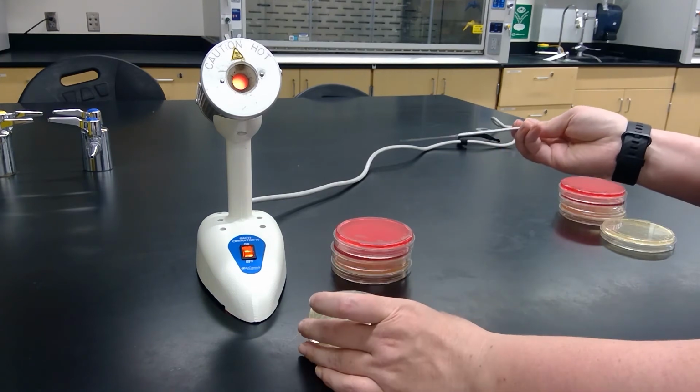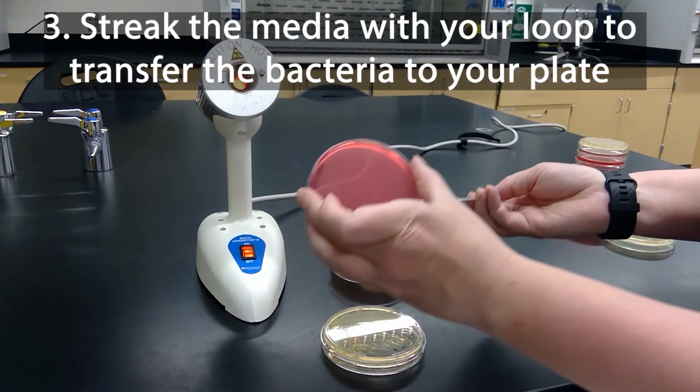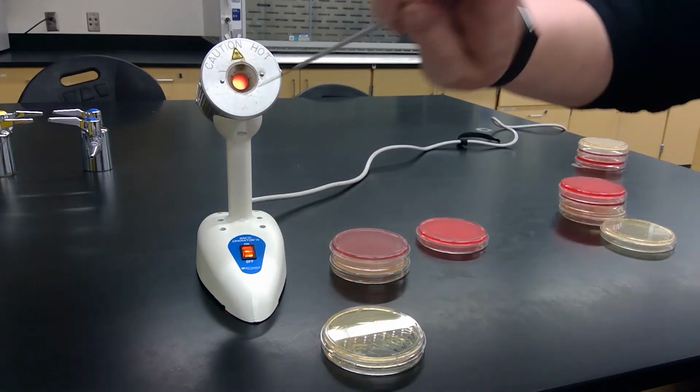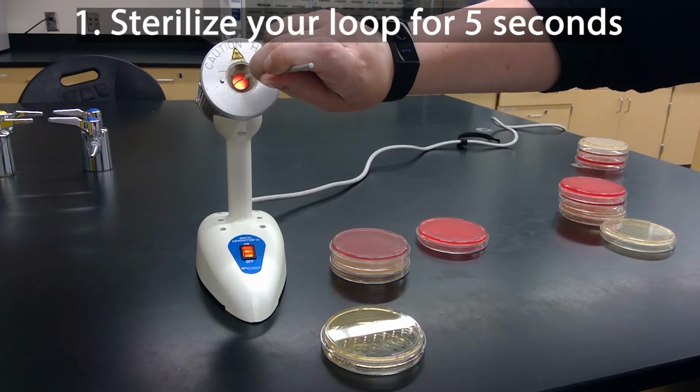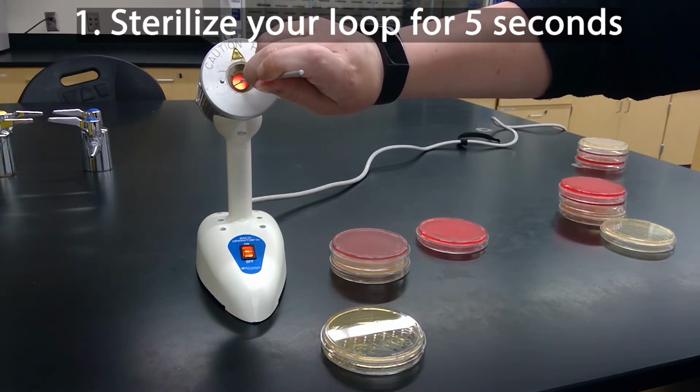This one. And then streak it onto plate. Then we'll sterilize the loop again.